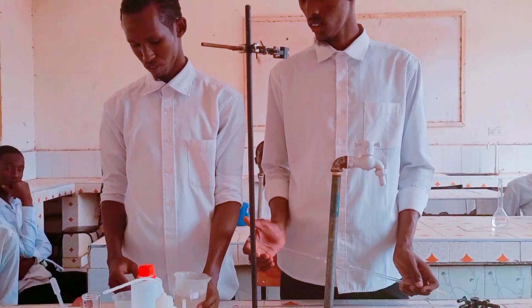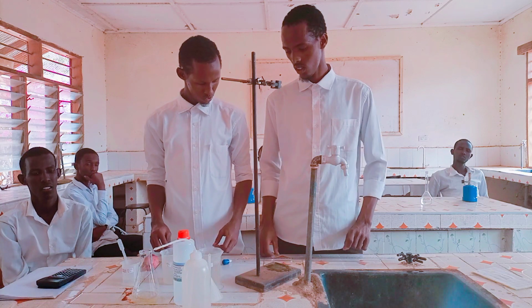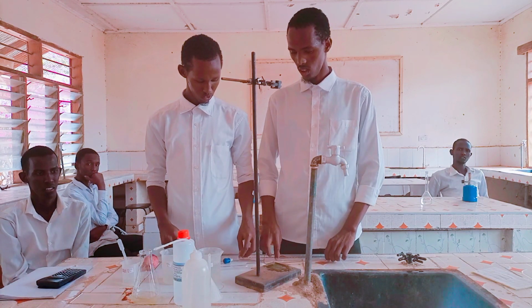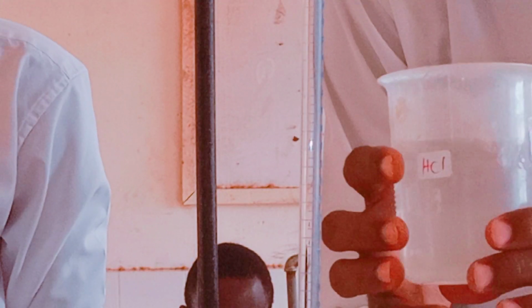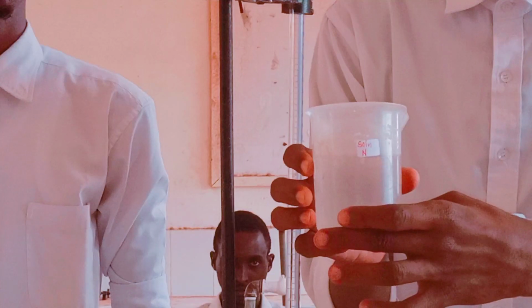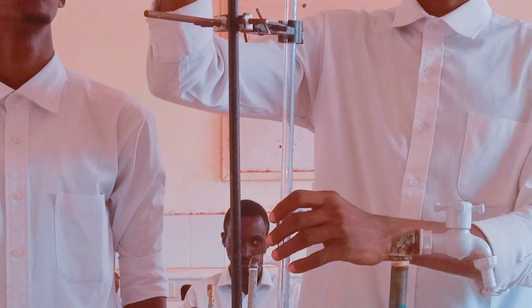Now, the procedure. Number one, fill the burette with solution N, which is hydrochloric acid. We put it in the burette.